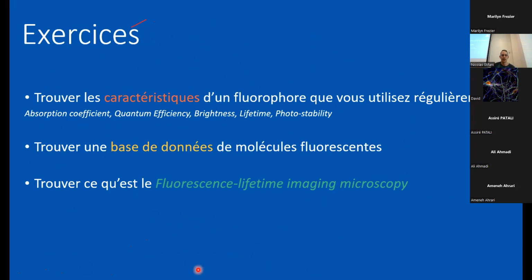So I'm going to take you. Do you use a fluorophore? Anyone else using a fluorophore here? Anyone using fluorescence? Okay, what fluorophore do you use? Alexa Fluor 488. Okay. Do you know what the absorption coefficient and the quantum efficiency are? I'm not really sure, because it doesn't affect my work, but I can look for it.